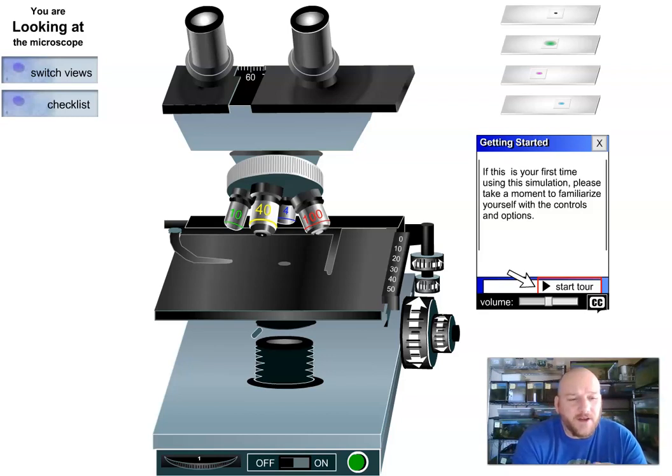Okay for my final review here we're going to be taking a look at this interactive microscope. There's some good stuff here in terms of just basic microscope use so I like it. There's no real experimental component but it's all focusing on the use of the scope so we can go through.